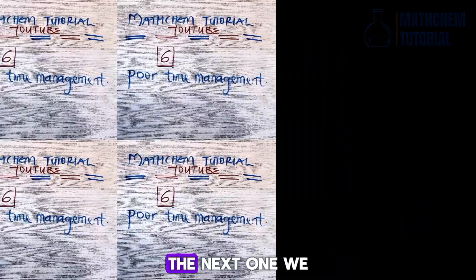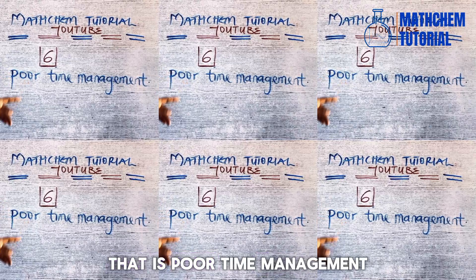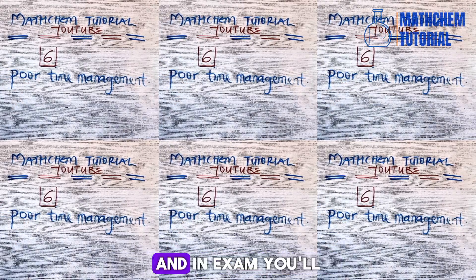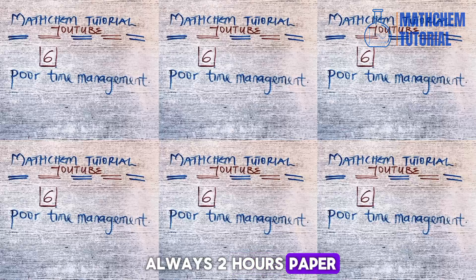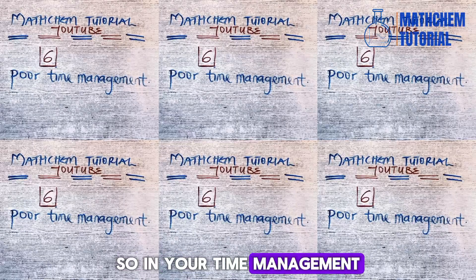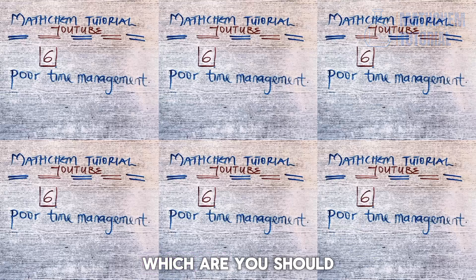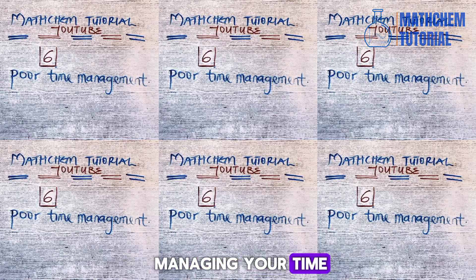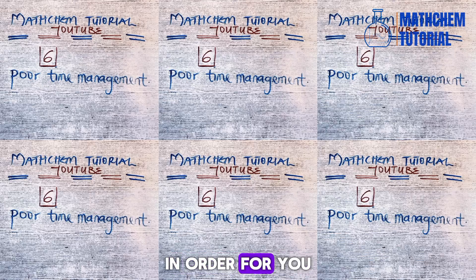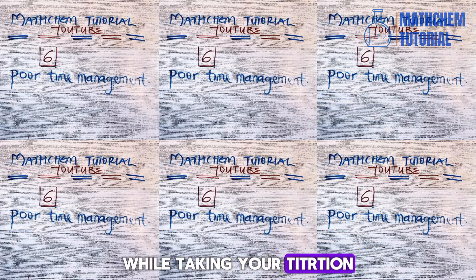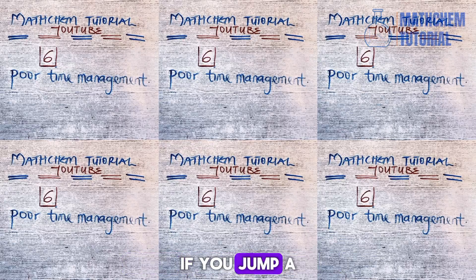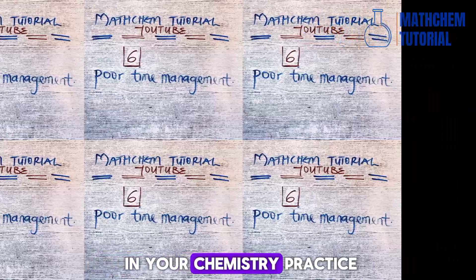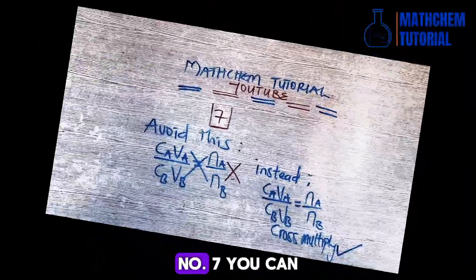Number six is poor time management. Many students do not know how to manage their time. In the exam, you are given a stipulated time — chemistry practical is usually a two-hour paper. In managing your time, you should not omit important steps just to save time. Schedule your time well while doing your titration and salt analysis, but do not omit important steps, because those steps might earn you good marks, and skipping them means you are losing marks.